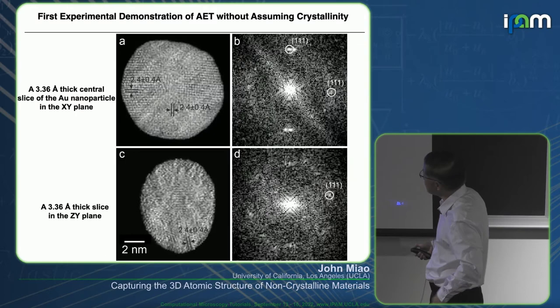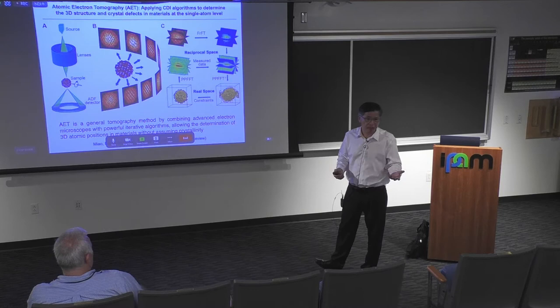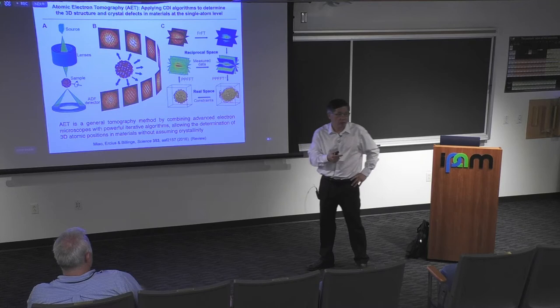Are you fast enough that you can then modify the data you record? This is a good point. We've been using GPUs, and the iterative algorithm is very fast nowadays. We've also been working on using deep learning, which can get this almost instantaneously. That's another future direction: how deep learning helps us to do 3D reconstruction, even 4D.